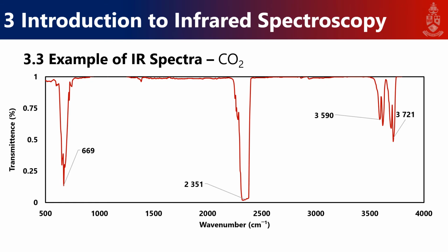So just as a very short example first, CO2, just some ideas of the type of motion that you can get. So you see the different peaks here or signals in the IR spectrum correlating to a wave number, so not wavelength, wave number. So you see the unit here, so you can easily translate it to wavelength, but just be cognizant of what the units are. And you see we get a variant type of motion. This is symmetric, this is asymmetric, this is like a waving motion, and this all leads to different kinds of stretches, right?